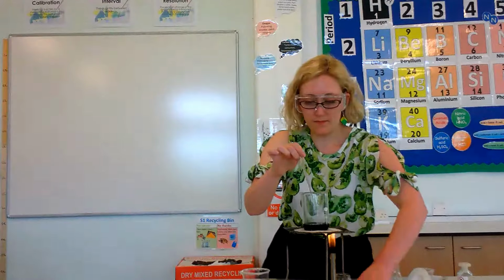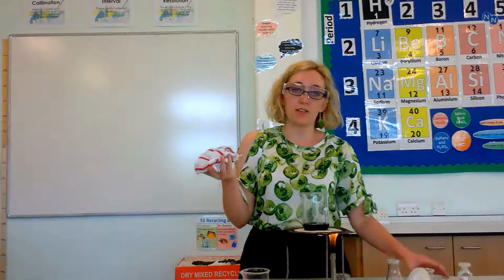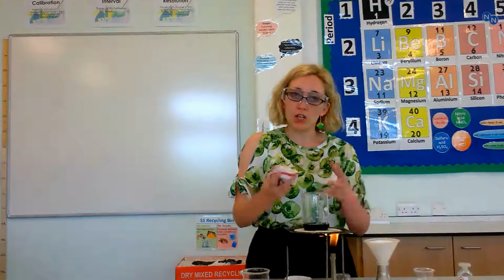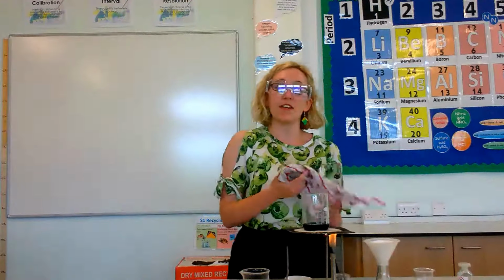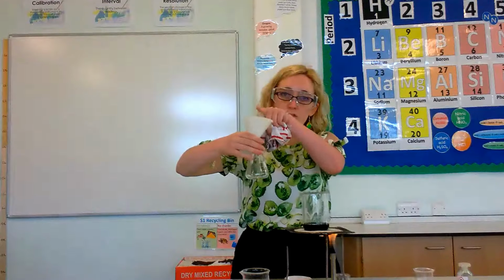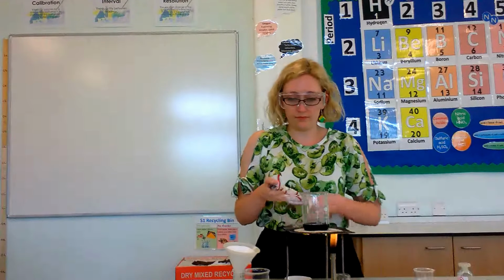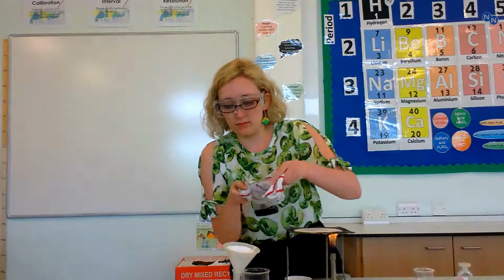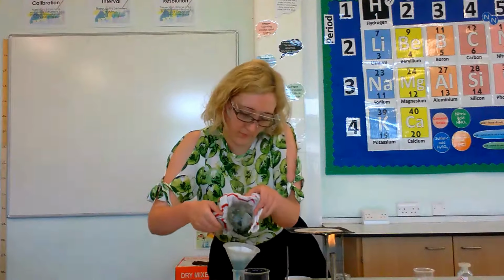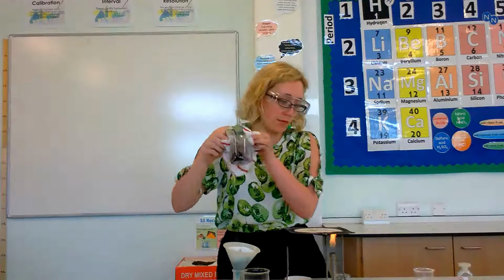I have got with me a damp cloth. Now I've got this because I don't want to pick that up with my bare hands. If you're doing it, you leave it a little bit so that it cools down, because we don't want to burn ourselves, but I'm going to pick it up with this. Then I'm going to filter it through my funnel, my filter paper, into my conical flask. Okay, now I've got lots of residue in there. I'm going to dispose of that safely and not put it down the sink, because remember, that is harmful to wildlife.